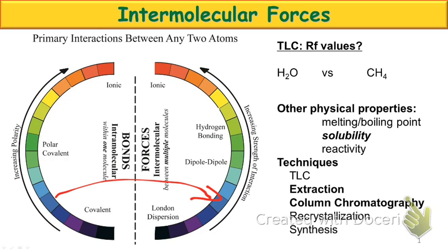Okay? We can use this information to our benefit for almost anything we'll do in lab, and believe it or not, 90% of the chemistry that you'll see in lecture is also explained by these bonds and forces. Okay? And depending on who you have, if you have Gould, it goes into a whole lot more detail with quantum chemistry than you'll see in most places, and in which case this is way too simple for him. Okay? So let's take advantage of this information to see what would happen with TLC.